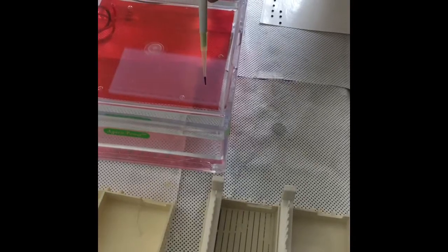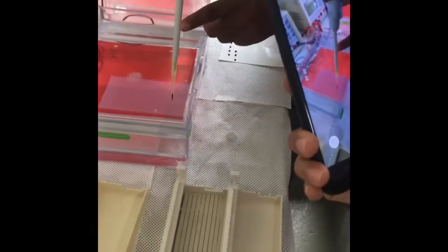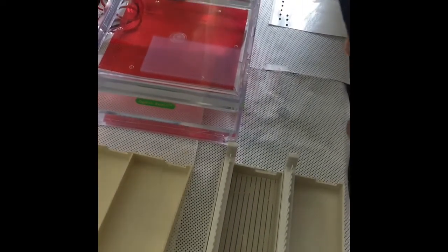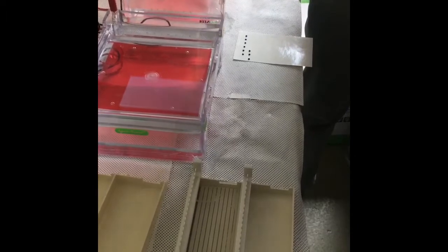Don't release before you go to the well, so it will release to outside. You have to check the well and bring your samples inside like this, and you can feel you are inside the well, and then release. Right? Sometimes your hand is shivering, so don't worry. Just use both hands and then release.